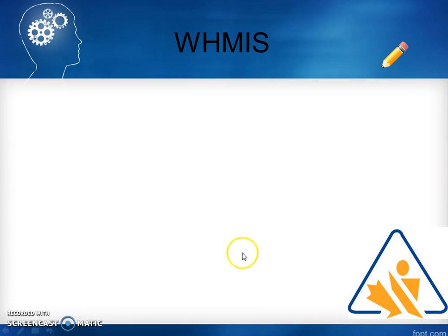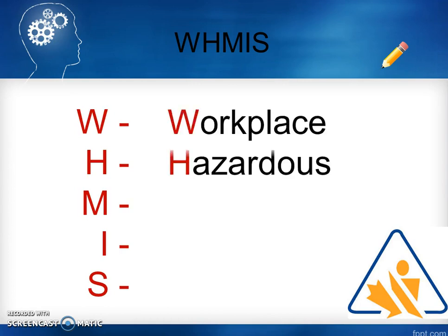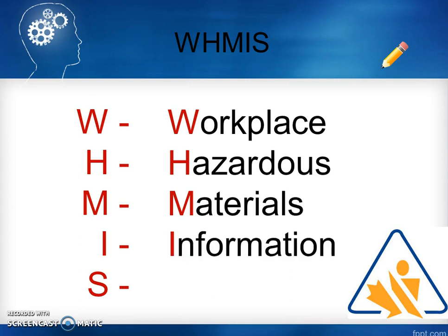Okay, WHMIS. I'm sure you've all seen this before. And note here the pencil. It is a copy, as most of this PowerPoint is. So WHMIS, what does it stand for? Each of the letters stand for something. The W for workplace, H, hazardous, M, materials, information, system.